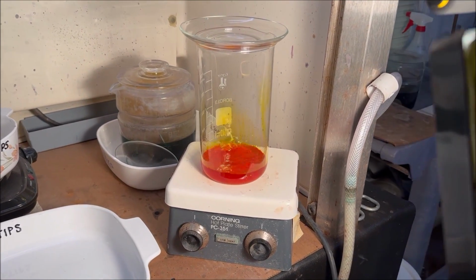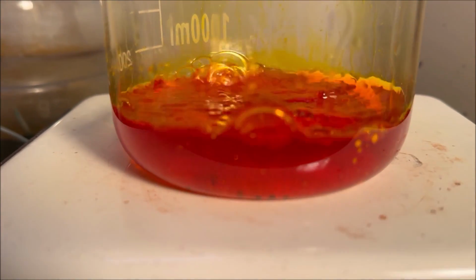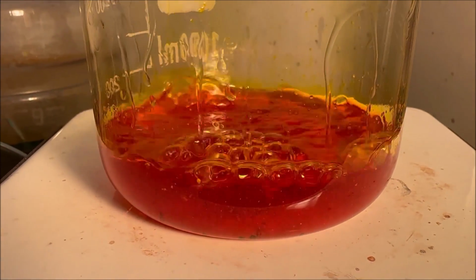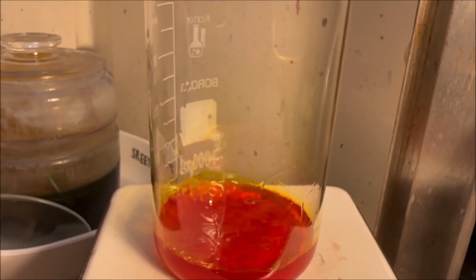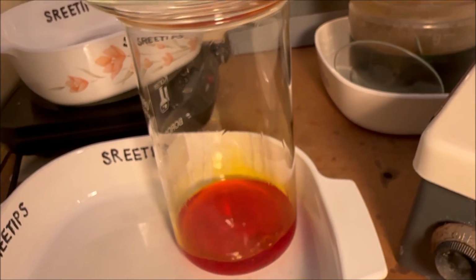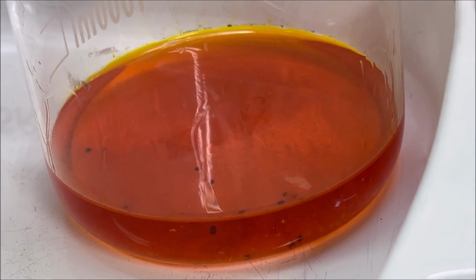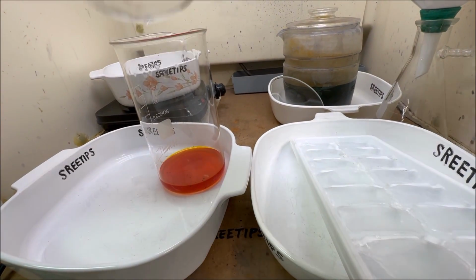This took about 2 hours to dissolve, and I still got some chunks of lead left down in there, and there's also some kind of precipitate, looks like, forming down in there. So what we're going to do now is take this off the heat and set it down here and let it cool off. Let's get some ice in here. If you look down in there, there's still some chunks of lead that didn't dissolve. There's some kind of precipitate down in there.